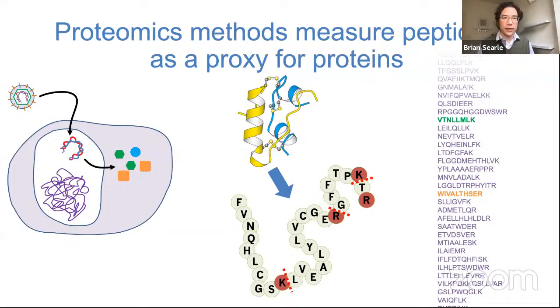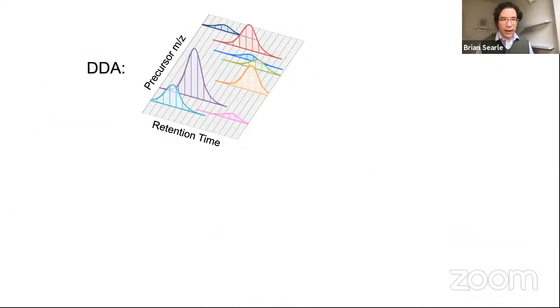They're hard to find. So in a problem like this, which is in a sense very similar to virtually every type of proteomic problem, rarely are we interested in the most abundant albumins of the world. We're really interested in the stuff that's difficult to see generally. So in these particular cases, we have a bunch of tools to be able to do that. I want to lead you through some of the ways in which we analyze this type of data. And the most common way in which we analyze this type of data is called data-dependent acquisition.